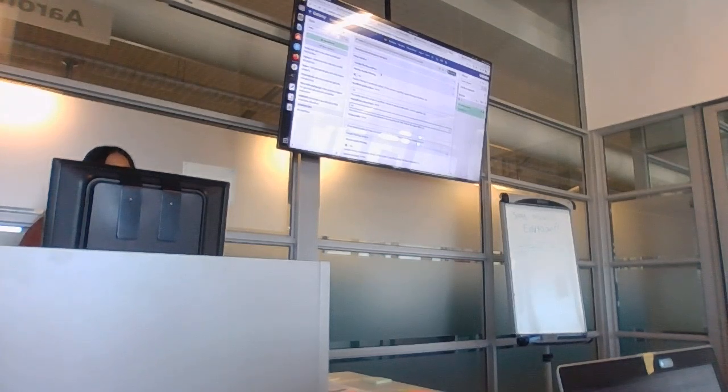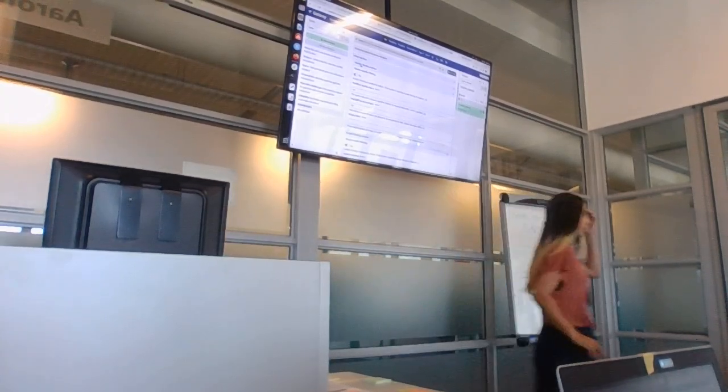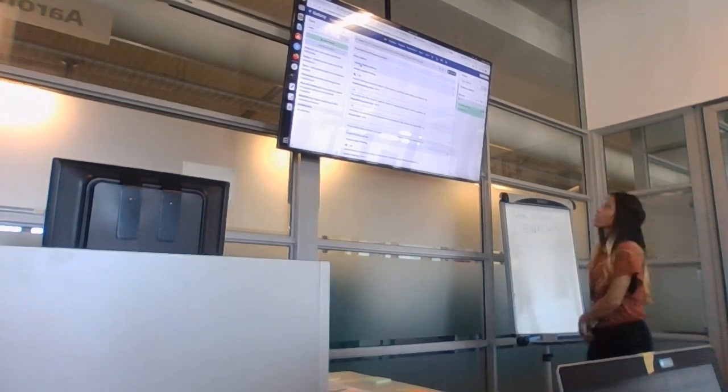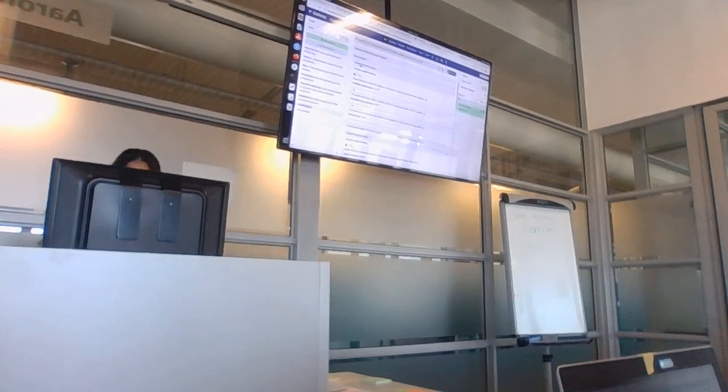If this is too overwhelming, I normally just click on this box again to close it. So again, under filter options, there's a quality filtering button. You will have to open that to find the parameters. Yes, so under filter options, scroll a bit down. Okay, yeah. 20 and 20 for the unqualified percent.